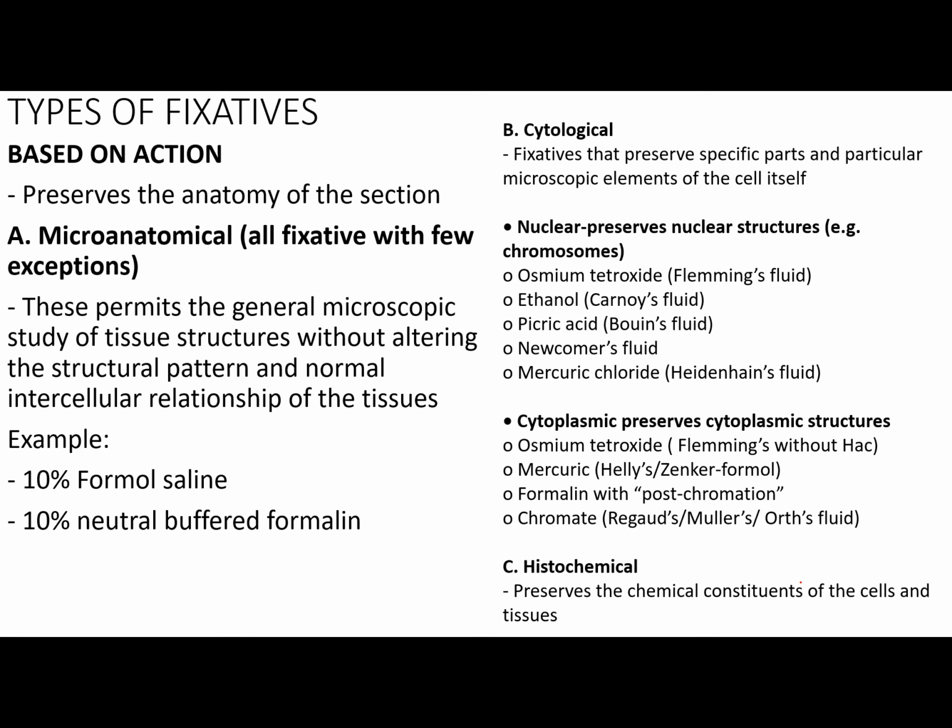Pag sinabi mong cytological class, pinipreserve niya yung specific part. It only preserves a specific part and a particular microscopic element. Para mas maintindihan nyo, kapag microanatomical general, meaning lahat is being preserved. Pero pag si cytological, depende. It depends. There are only specific parts and this is divided into two. Pwede siyang mag-preserve ng nuclear material or nuclear structure or cytoplasmic structures niya.